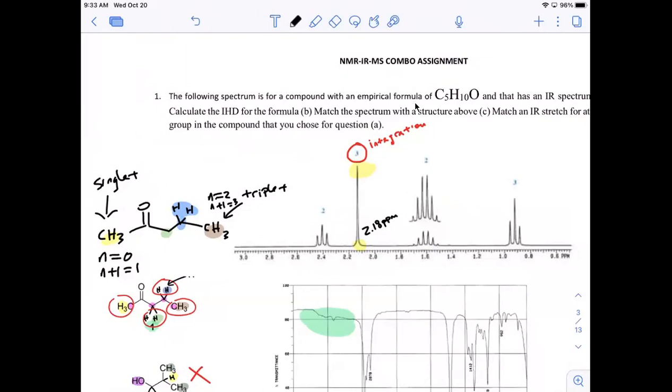The alkyl protons, like that one, are they going to be more upfield or downfield? Right, because you got 2 triplets. There's another way we can tell them apart too, but upfield, they'll be more upfield. That's one piece of evidence to help us figure out which triplet is which.